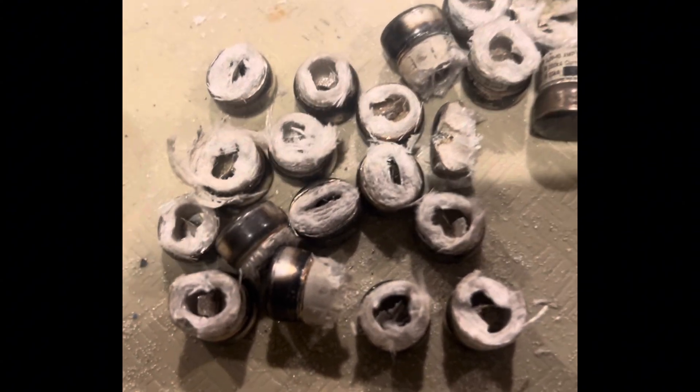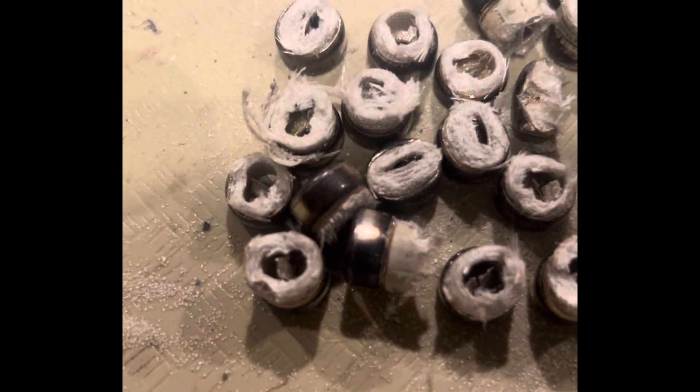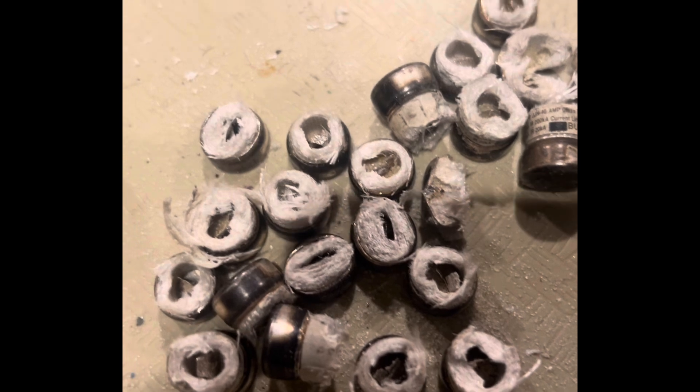I'm going to soak those in hot boiling water to see if they loosen up, or pull them out. If I have any trouble I'll just put it in nitric — that's fiberglass — and I'll filter the stuff out. We'll see how that goes.